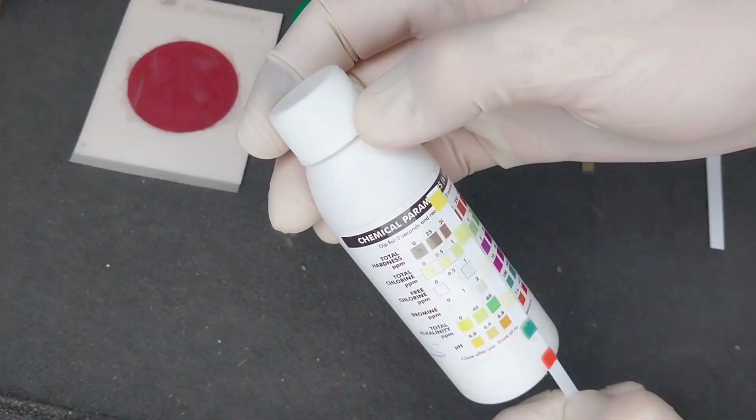We take this type of data, we put it into an app that we've developed, and it pumps out the results. It gives us a full breakdown, a full picture of the water quality at that point. So what I'll do is go and enter this onto the app a bit later, make sure these details are recorded correctly, and then with that information, we'll be able to make a more discernible decision on the quality here. And of course, then lastly, we'll just have to wait 2 days for those to come through.